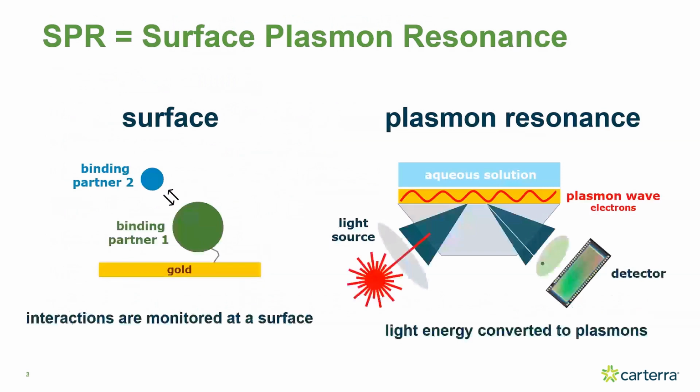In our case, it's a large CCD sensor that collects essentially an image of the entire array surface. Ideally, you get total reflection of the light off the bottom of the surface, so you see essentially a saturating brightness on the detector.